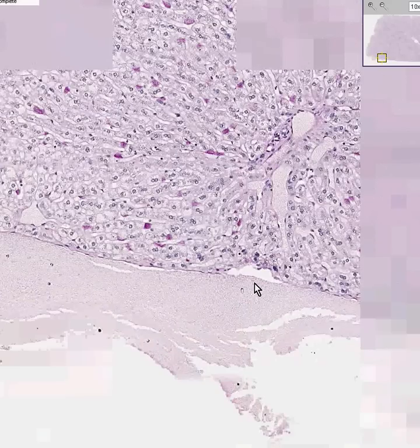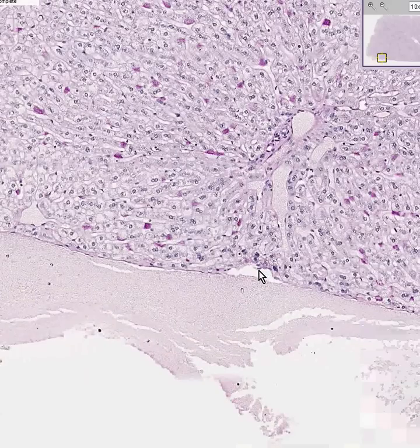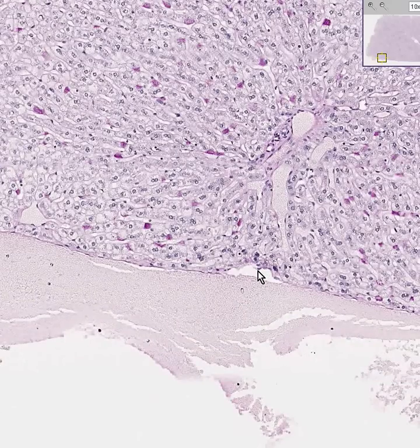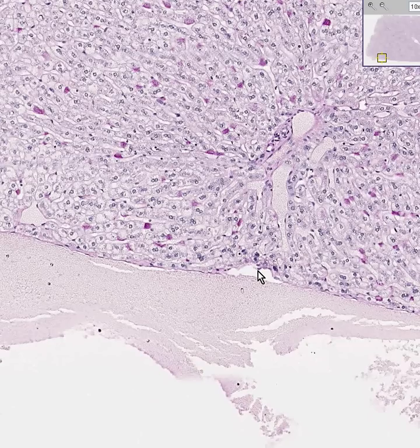The only thing left is this little bit of connective tissue of the capsule, and maybe, if we're lucky, a mesothelial cell representing the visceral serosa of the liver. And we are done.